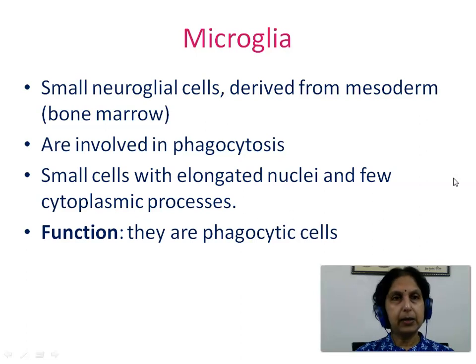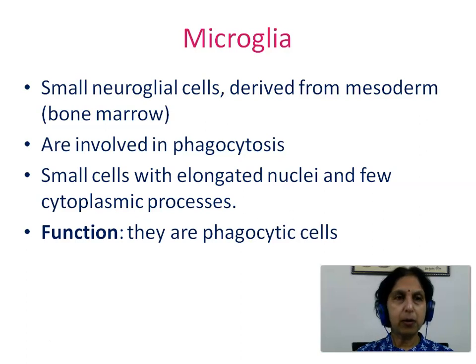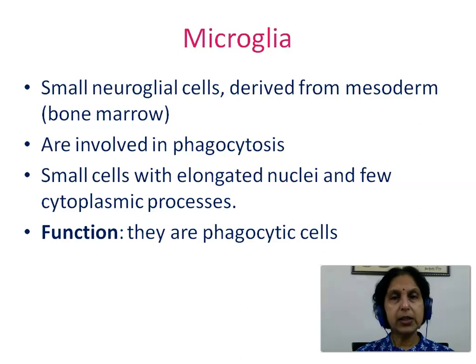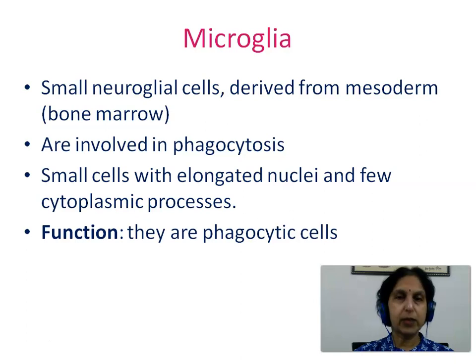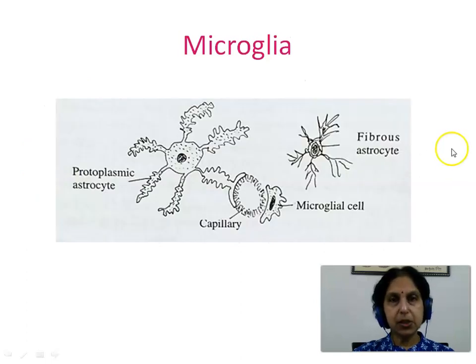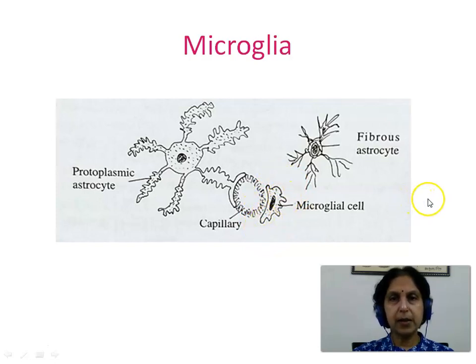Microglia are small neuroglial cells derived from mesoderm, that is the bone marrow. They are involved in phagocytosis — small cells with elongated nuclei and few cytoplasmic processes. These are phagocytic cells. This picture shows the microglia cell: a small cell with an elongated nucleus and some cell processes.